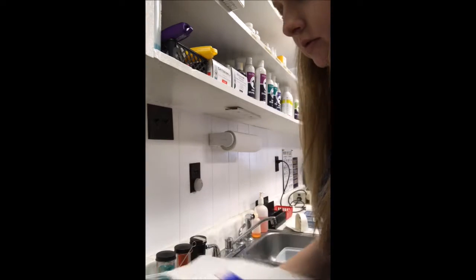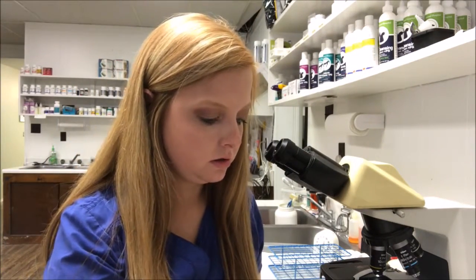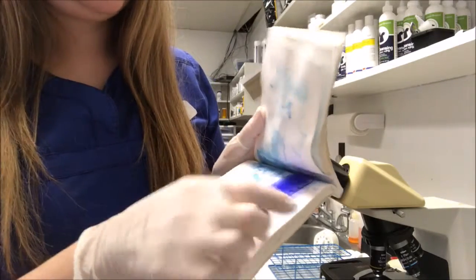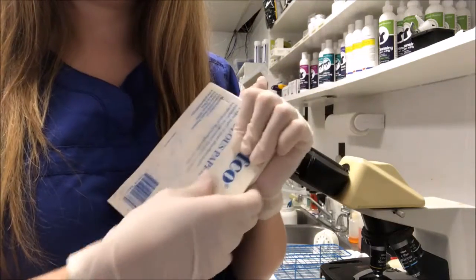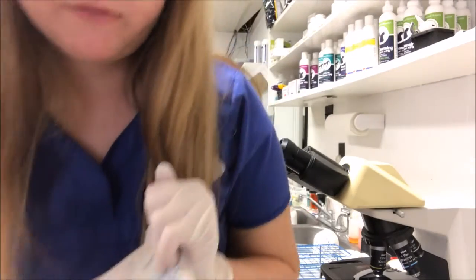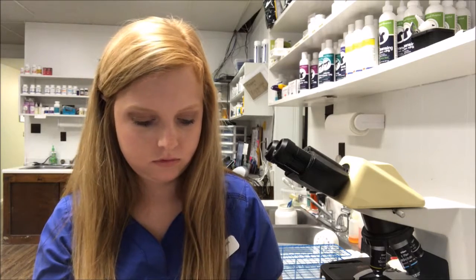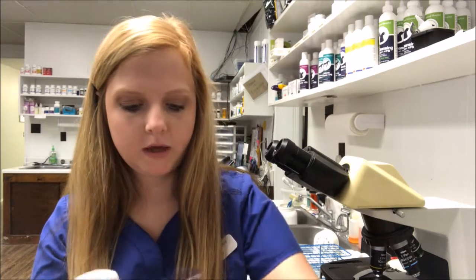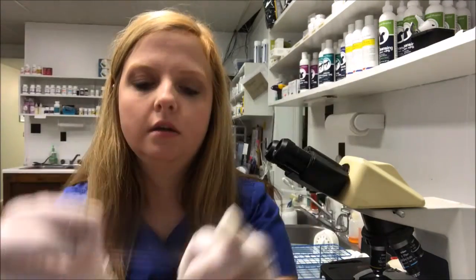Grab a paper towel. Just going to let it dry on here. Okay, so now I'm just going to get my paper book here, and I'm going to put the slide in here, and this dries it. I'm just going to press gently. This just gets all the excess off of it. Okay, now we have a good dry stained sample.